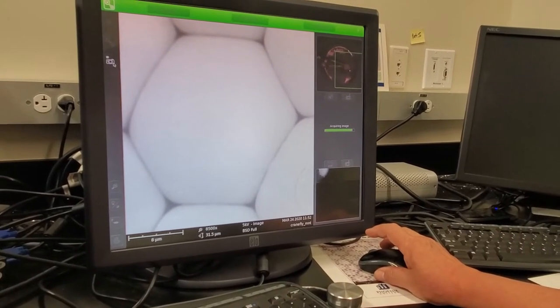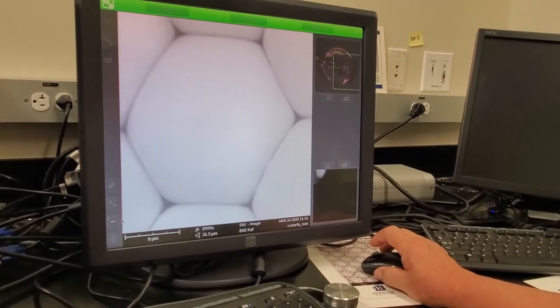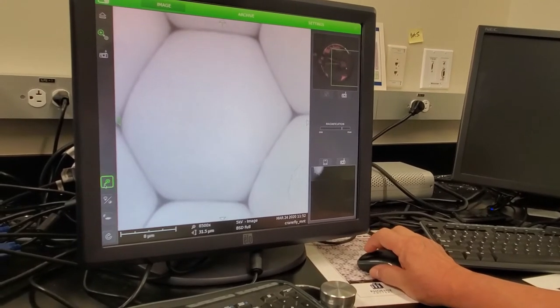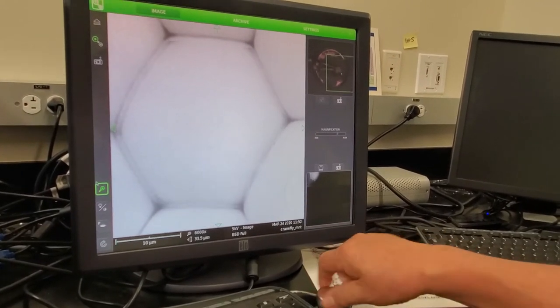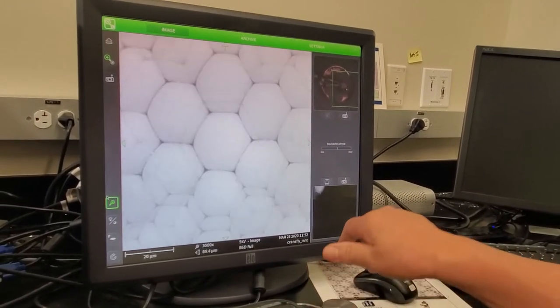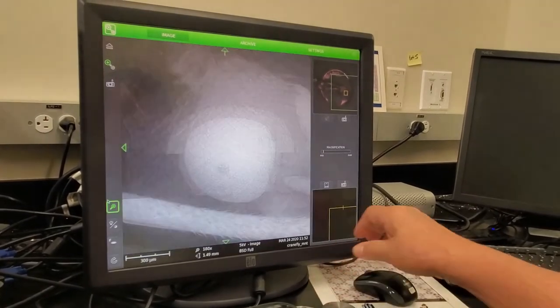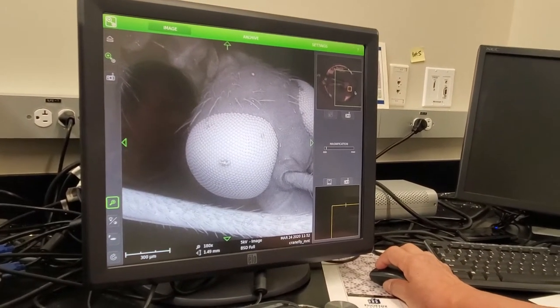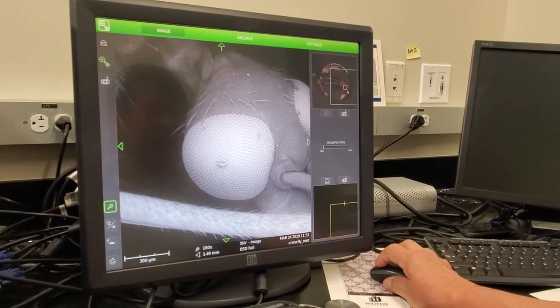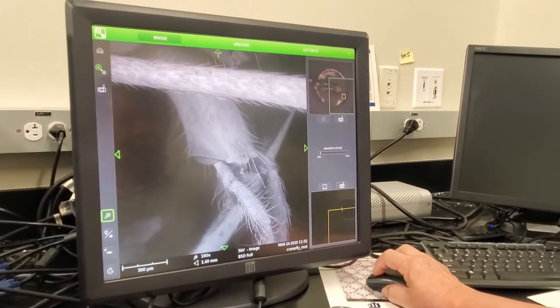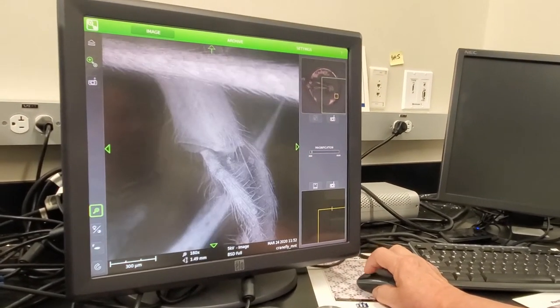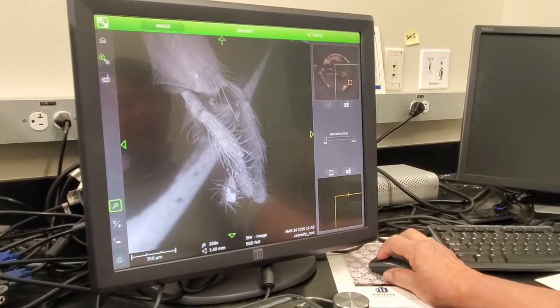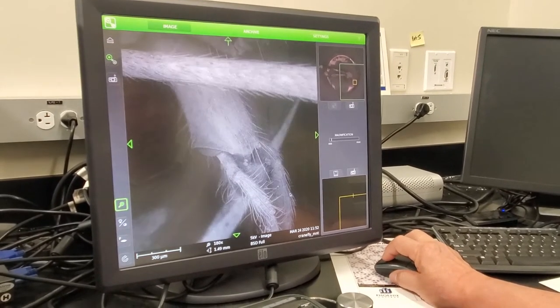Now let's go to the mouthpiece. What's the strategy? Zoom out. That gives you a view, but I think it's out of range. The mouthpiece is over here somewhere. There's the mouthpiece. So this is the mouthpiece for a crane fly.